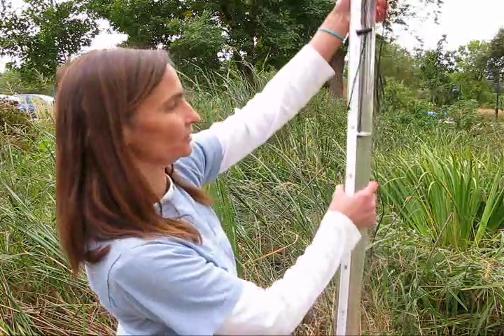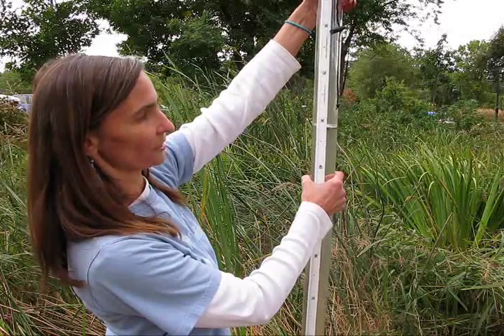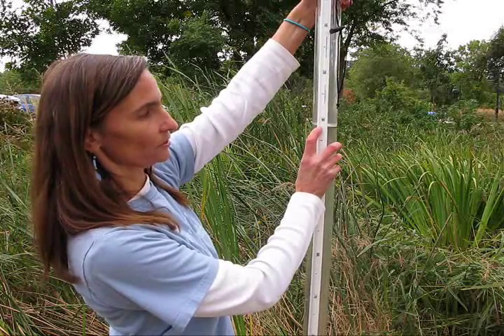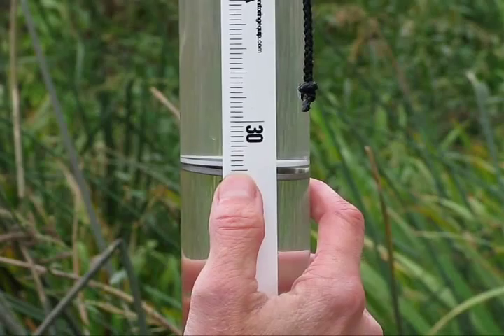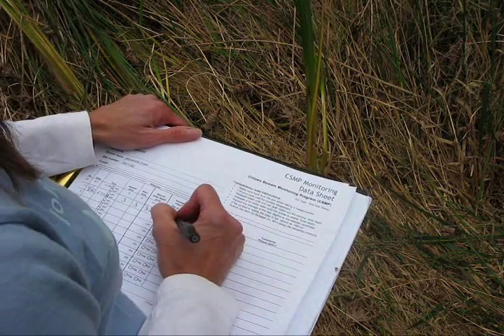Raise the tube until you can see the disc on the centimeter scale on the side of the tube. This is the reading you'll record on your datasheet. As you can see, the Secchi Tube is easy to use. Thank you for your interest in stream monitoring.